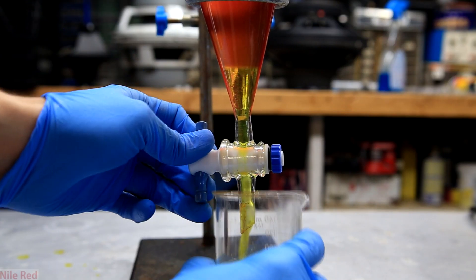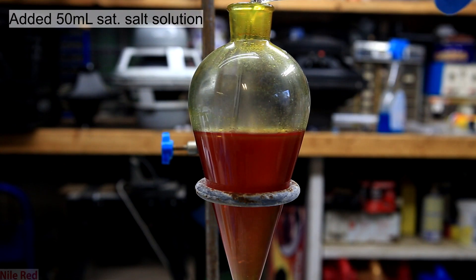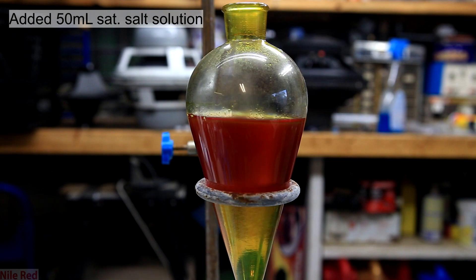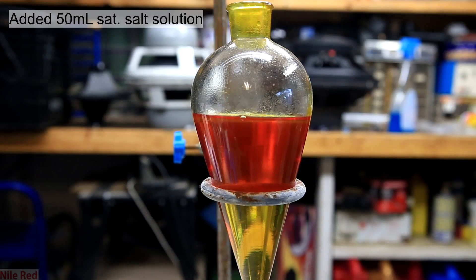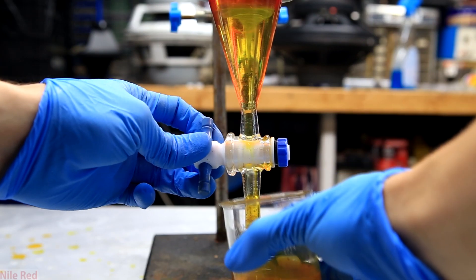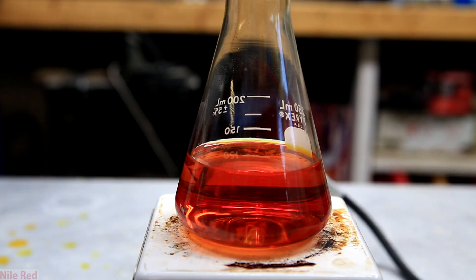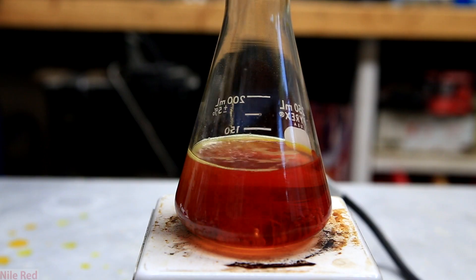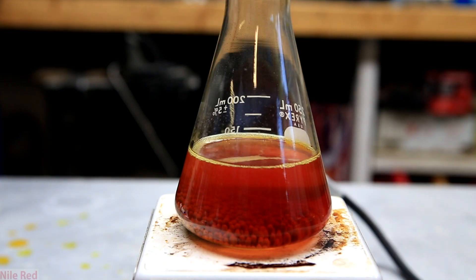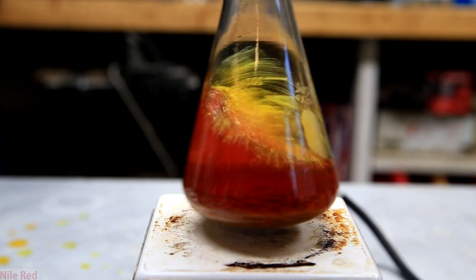Once the layers have separated, we can discard our lower water layer. The washing step is repeated, but this time I use 50 milliliters of saturated salt solution. You'll notice that before adding it, the top ether layer is a little cloudy. However, after the capping, shaking and venting, you can see it's cleared up a lot. The bottom layer, which is mostly water, is drained away into a beaker. The upper ether layer is poured into an Erlenmeyer flask and it's dried using molecular sieves, just to pull out any water that might remain. I also could have used another compatible drying agent like sodium sulfate, but I just like molecular sieves.